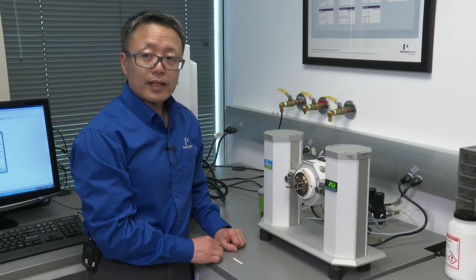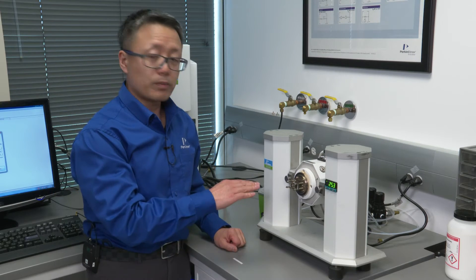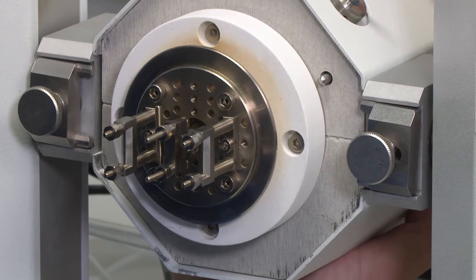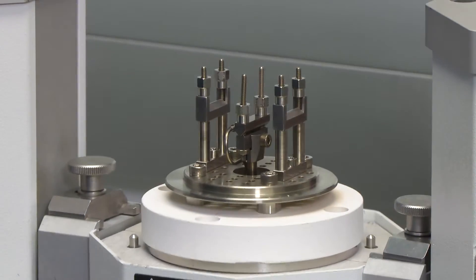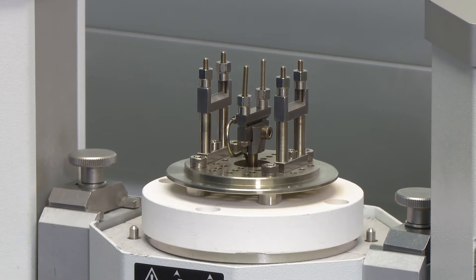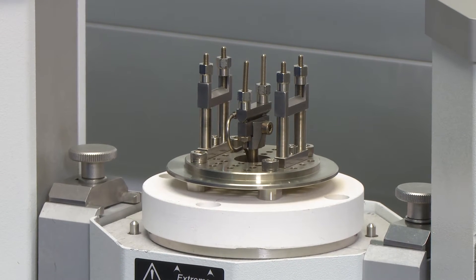After calibrating the zero position at the horizontal position, the second step of the calibration is to calibrate the probe position at the vertical position.